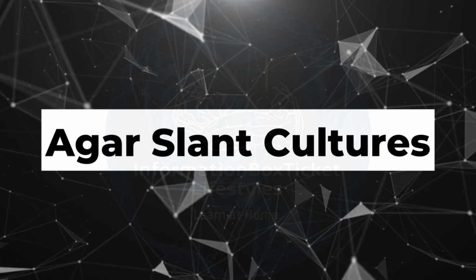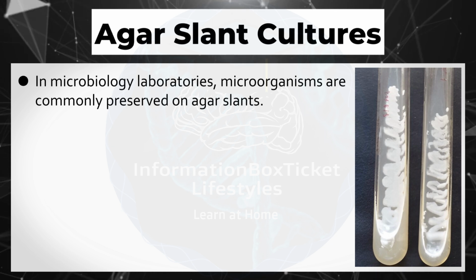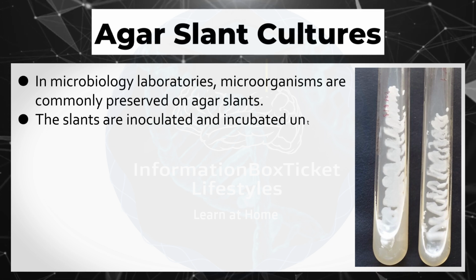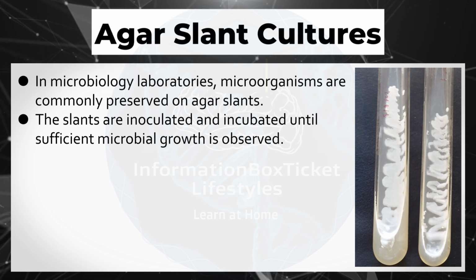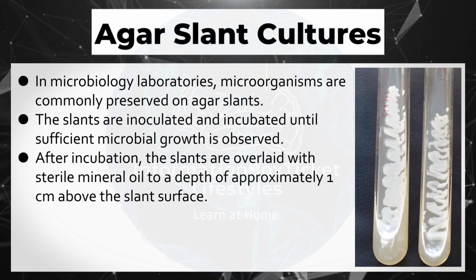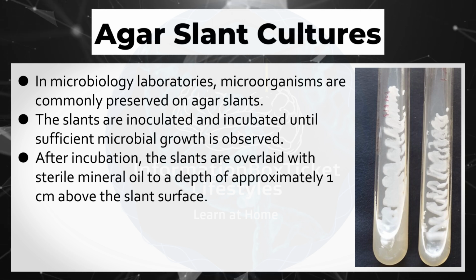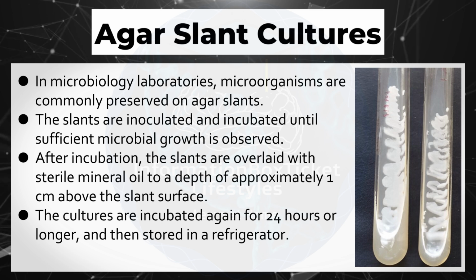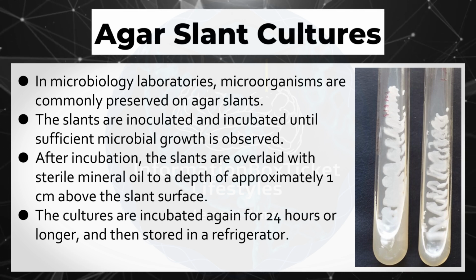Agar slant cultures. In microbiology laboratories, microorganisms are commonly preserved on agar slants. The slants are inoculated and incubated until sufficient microbial growth is observed. After incubation, the slants are overlaid with sterile mineral oil to a depth of approximately 1 centimeter above the slant surface. The cultures are incubated again for 24 hours or longer, and then stored in a refrigerator.